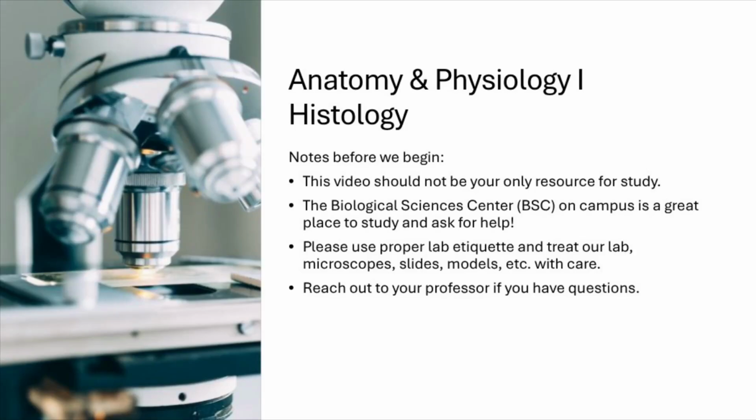All right, today we're going to be looking at the Anatomy and Physiology 1 Histology objectives. Now, it's not going to be all of them, but we are going to look at a few. But some notes before we get started is that this video should not be your only resource for study.